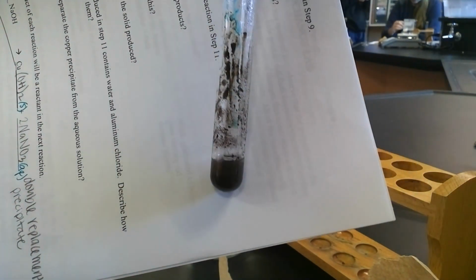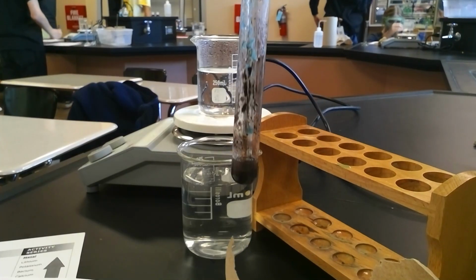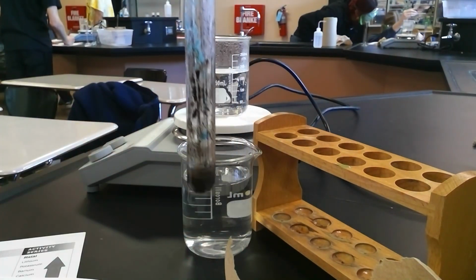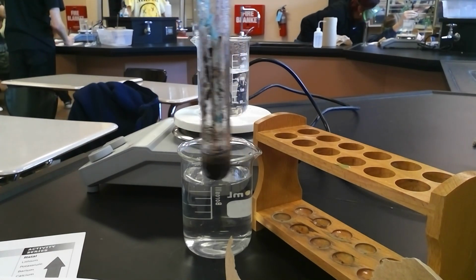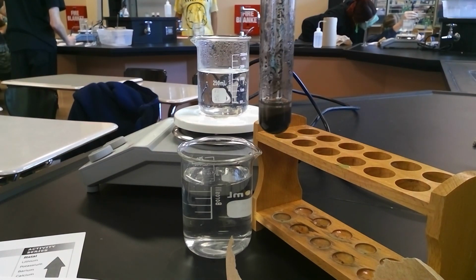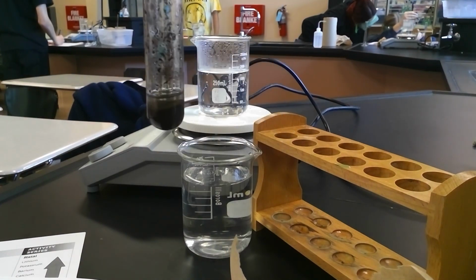So part of what was produced, I wish we had light. Part of what was produced definitely looks like it's turning clearish up here, separating from the darker precipitate at the bottom. Or I guess it's a little bit of a misnomer to call that a precipitate. And the longer it sits, the more you can actually see those layers separating out. So you can see that clearly we have water being produced. So you see that clear layer on top of the darker precipitate.